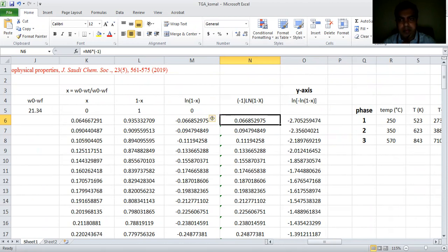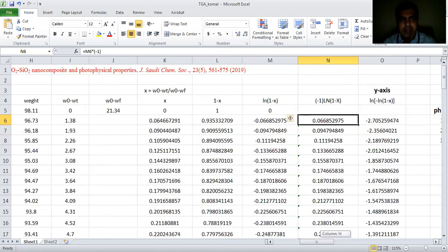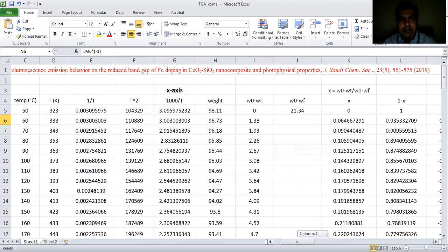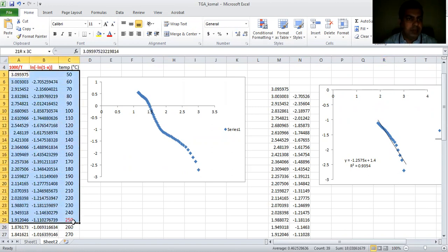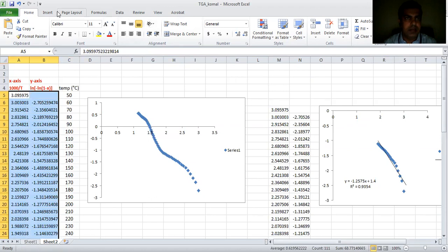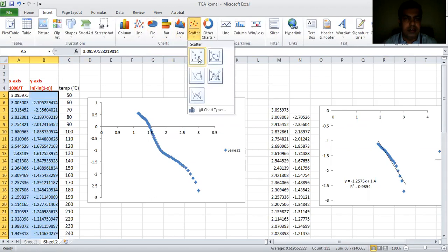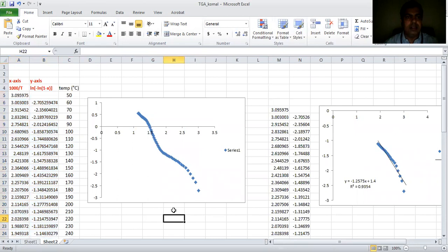Now you can plot — this is your y-axis and this is your x-axis. I have plotted as a reference over here. When you plot this it will give you this graph, and it is very easy to plot. As a reference I'm going to show you — just select all this data, go to Insert, take the scatter option, and this will give you the same graph. I'll delete this one, as the graph I've used is from the already published paper.